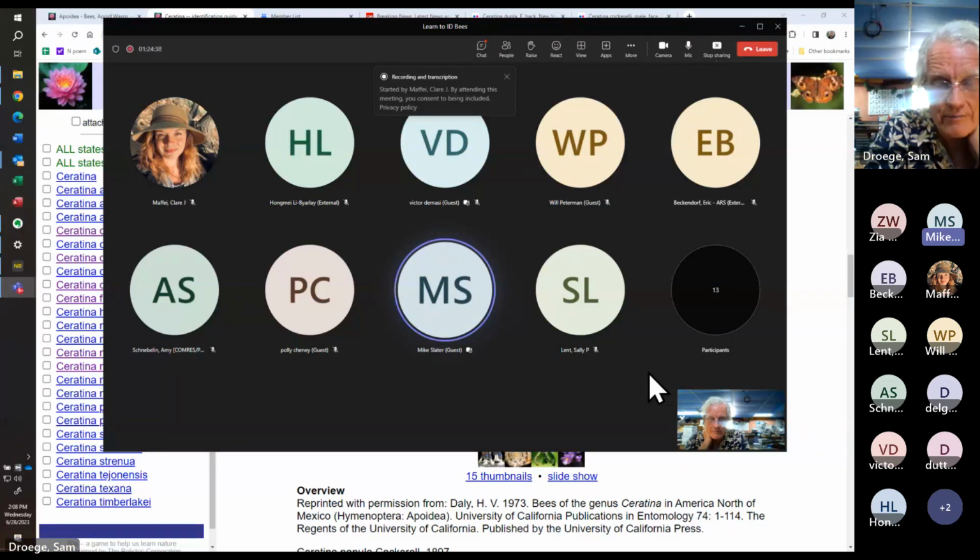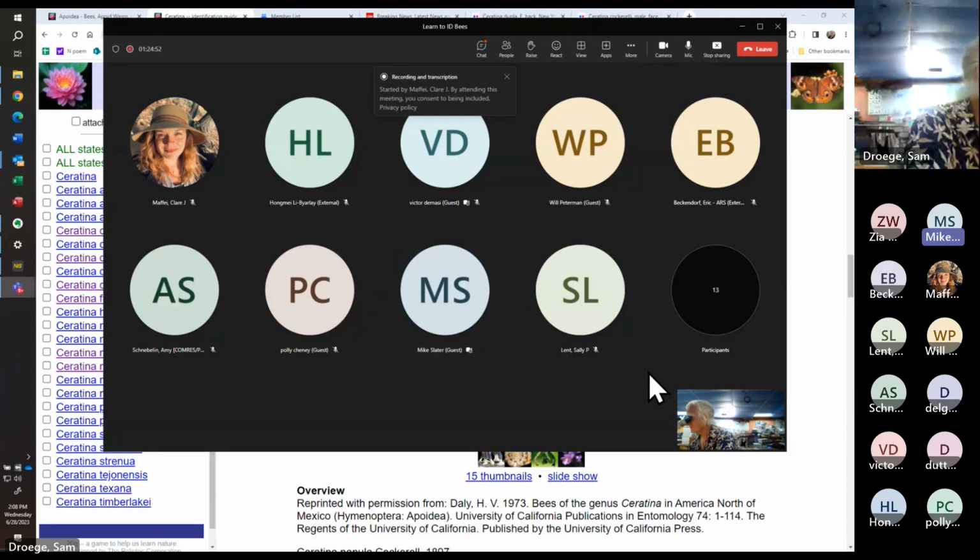It's definitely a line there on almost all the specimens I've been pulling out and looking at, depending on the angle. It's not quite as deep as the central line, but it's definitely like a suture line that's quite visible.